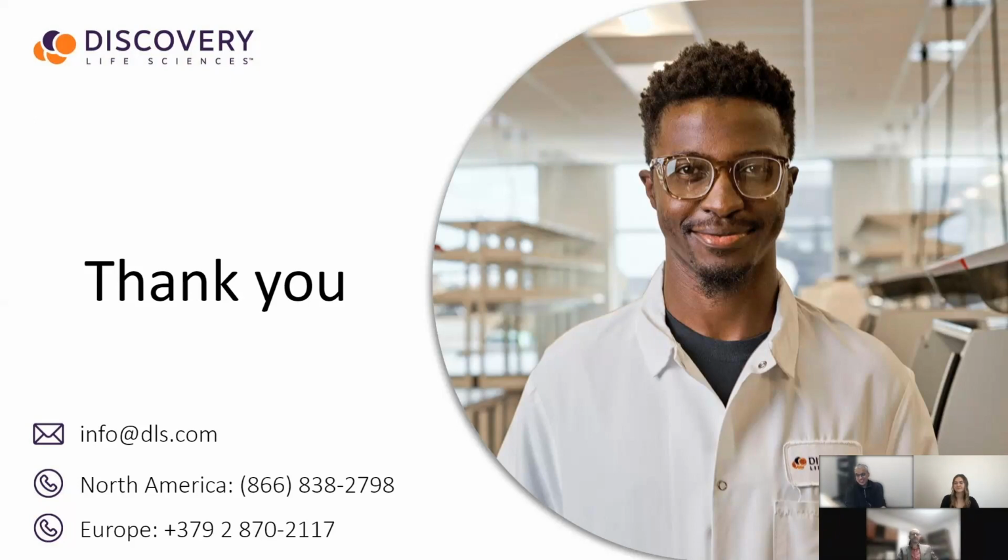To be very honest with you, as I said, there are two parts of the process. One is extraction, and one is library prep. I think you cannot discount one for another. I see one of the questions also on the follow up is, are you extracting with Covaris and then using it? The answer is yes. Let me put it this way: our entire FFPE extraction, whether it's a single extraction, meaning either DNA or RNA, or dual extraction, deploys Covaris.